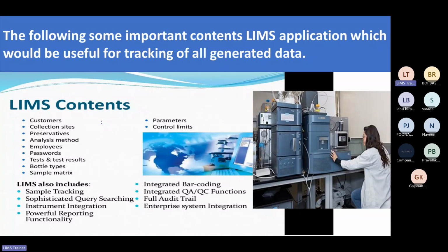Okay, so LIMS content. These are the different contents that are related to the software. Who are dealing with the particular software? The customers, collection sites, the preservatives, the analysis method. All these I am going to explain in our further lectures.